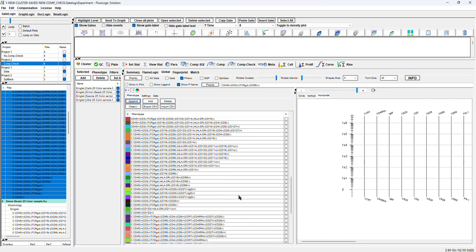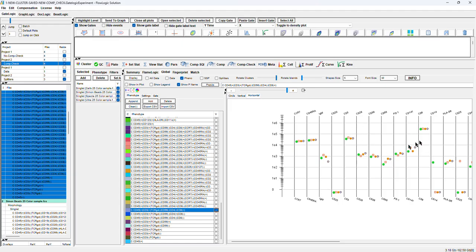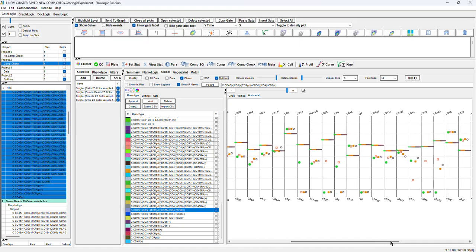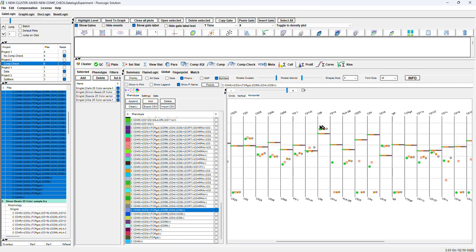We want to verify the population extracted, and we go, for example, and we try to visualize our CD8 positive. So we click the button, we can display the splitters so we know what is positive and what is negative. And this is our setting, CD4 negative, and we should have CD8 positive. And we can see the CD8 positive is at the same level.